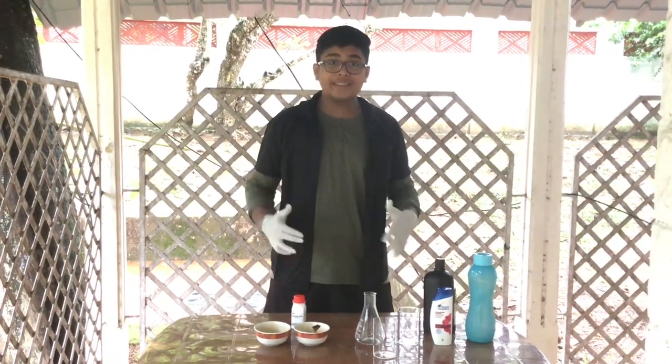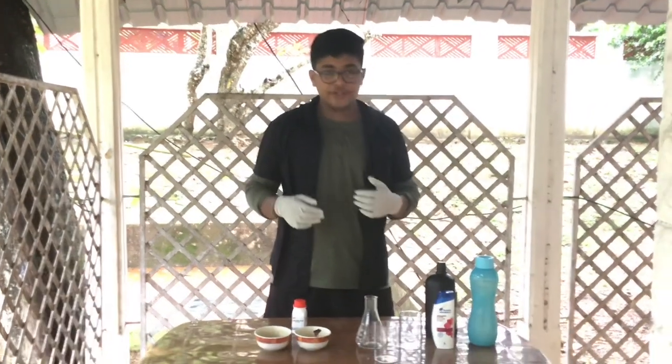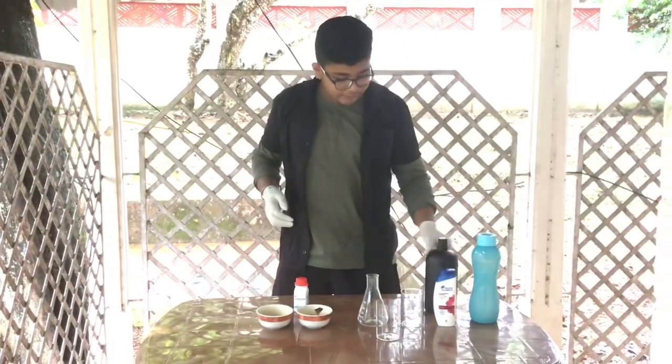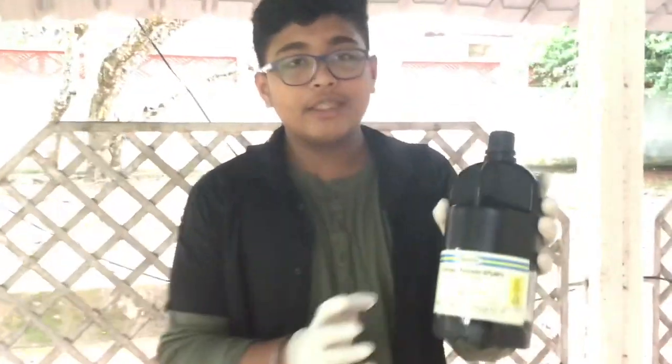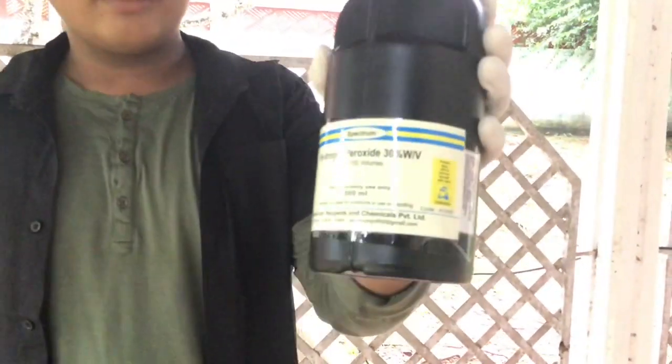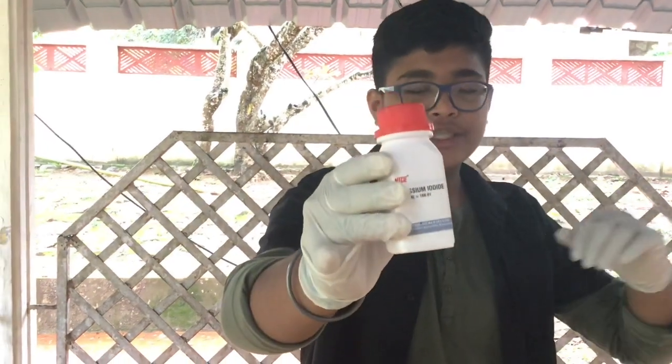It's an amazing experiment, but it's a little dangerous and you should definitely have a glove with you, because here we are going to use hydrogen peroxide, which is 30% concentrated. That's going to be really powerful. And also we're going to use some potassium iodide. I've purchased this from a nearby scientific lab. So what we're going to do is dilute this potassium iodide first.